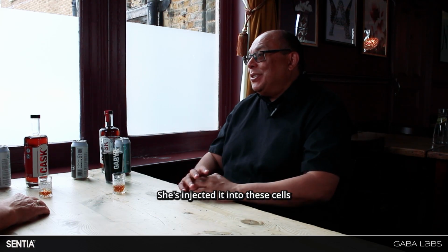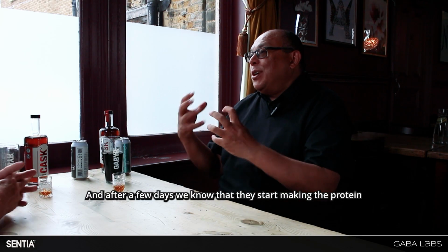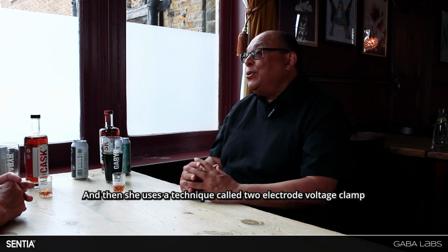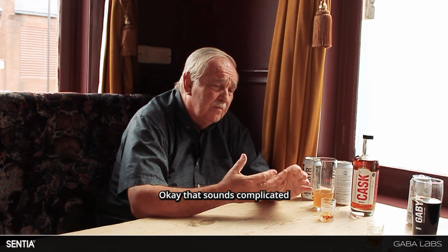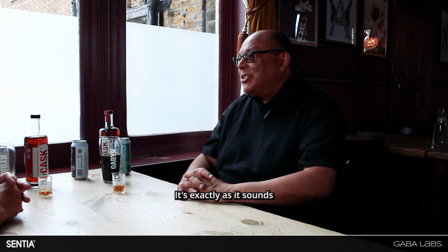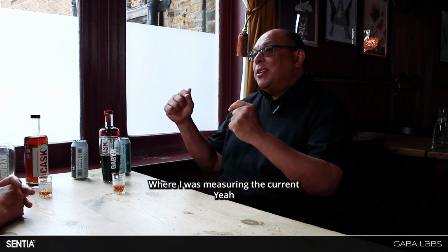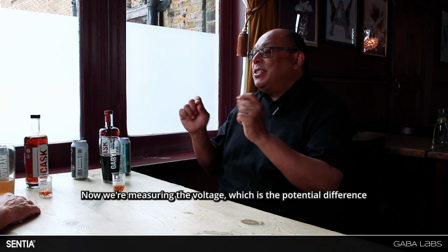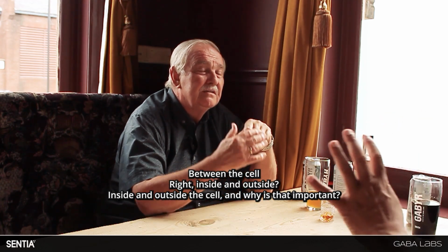She's injected it into these cells, the oocytes. And after a few days, we know that they start making the protein. And then she used a technique called two-electrode voltage clamp. Okay, that sounds complicated. It's exactly as it sounds. Instead of just having one electrode measuring the currents, now we're measuring the voltage, which is the potential difference between inside and outside the cell.